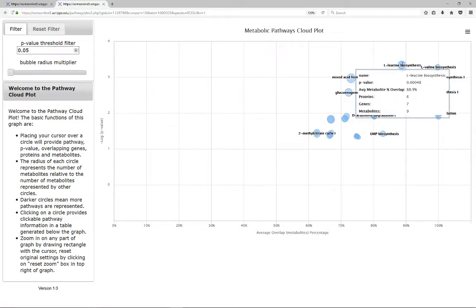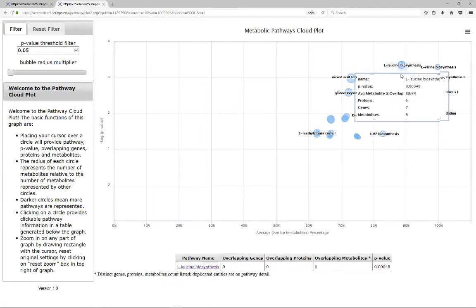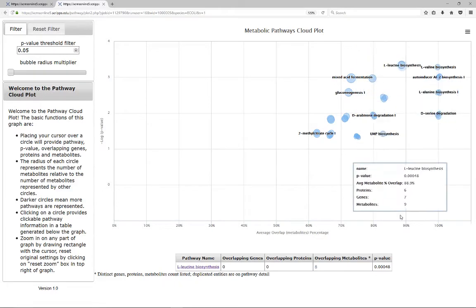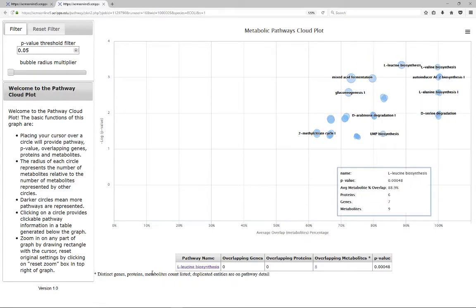Click on the circle to display a brief pathway results table in which additional information can be accessed through the hyperlinks.